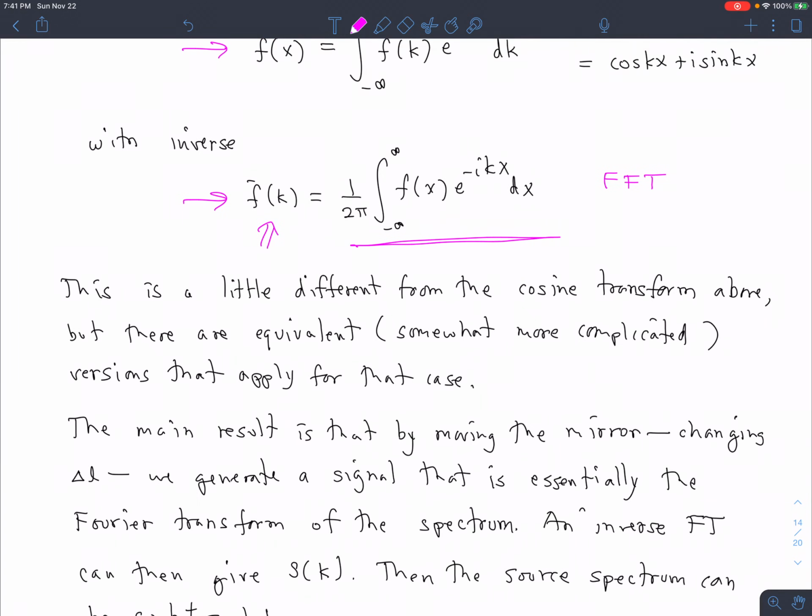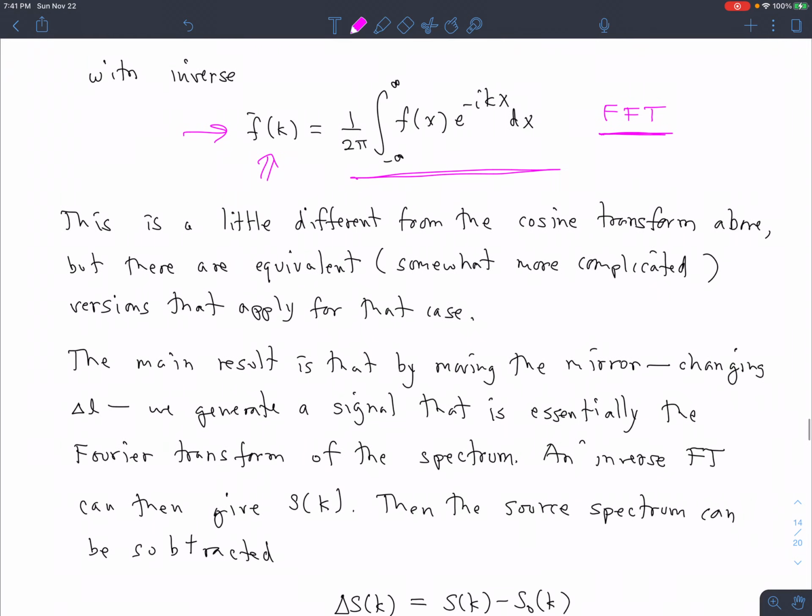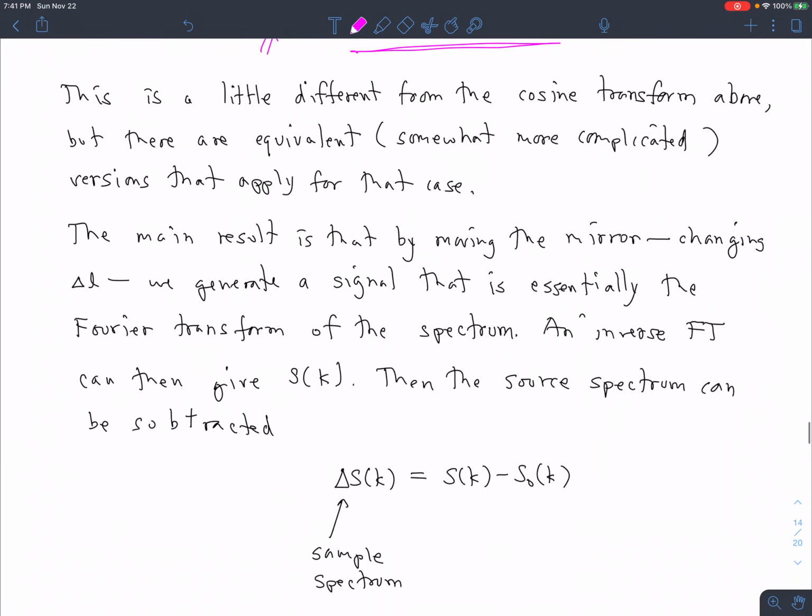Actually, the STM images, the Fourier transformed images that gave the spots for the lattice of the graphite, use an FFT. I have no doubt. I haven't checked that out directly, but it's so ubiquitous that it's got to be an FFT.